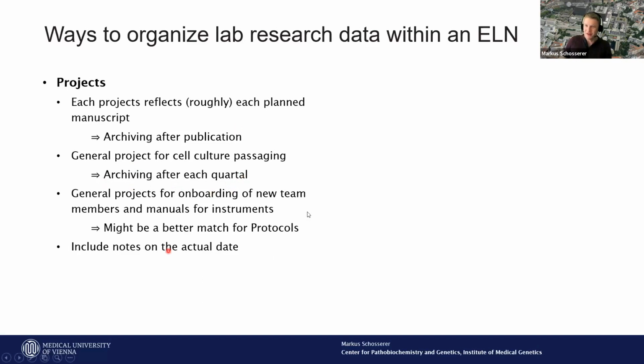So you also want to think about regularly archiving your projects, because else you will end up with 50, 60 different projects, and then it becomes too much and not very nicely viewable anymore. And then we also have general projects for when a new team member joins our group for onboarding, and also manuals for different instruments. In hindsight, this maybe would fit better to a protocol. So instead of making a project with that, you could also make a protocol with that.